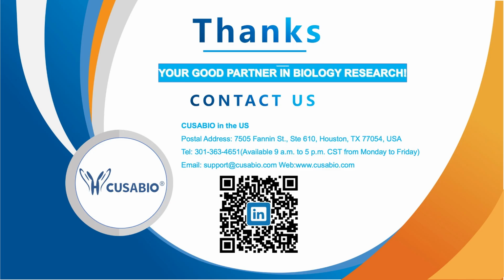Okay, so based on our result, the effective concentration range can be 1 to 4 micrograms per ml. But we still suggest our users to determine the optimal DT3C concentration themselves, because different labs have different experiments. So the strategy here is that you can determine the optimal DT3C concentration first.